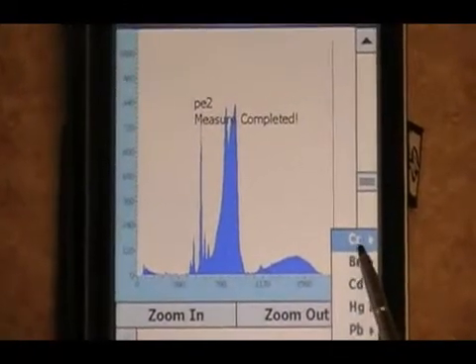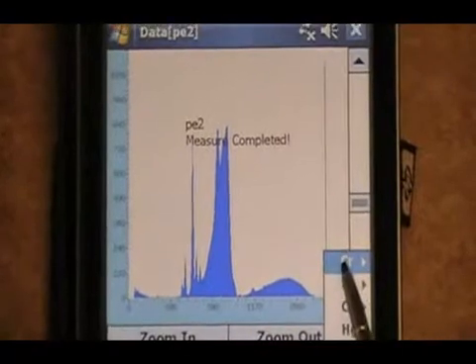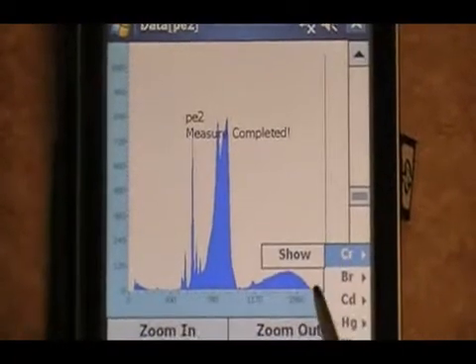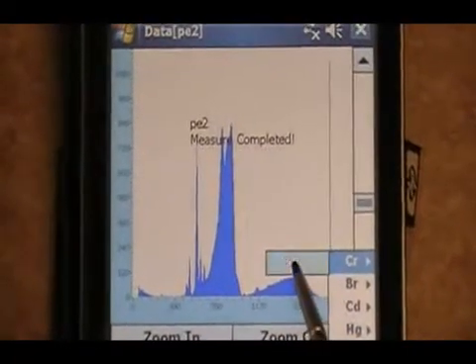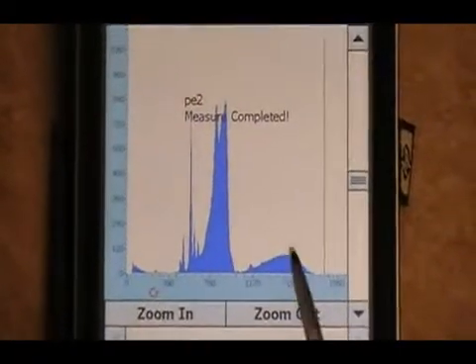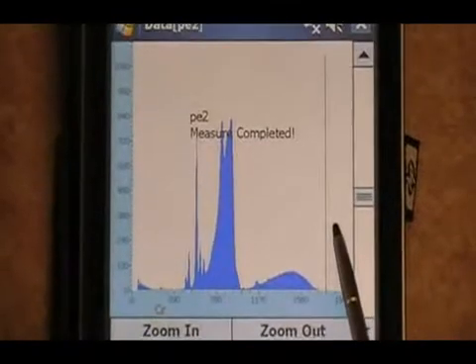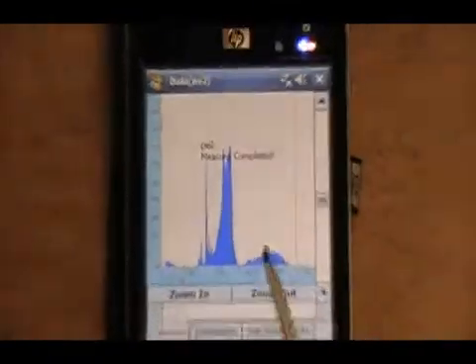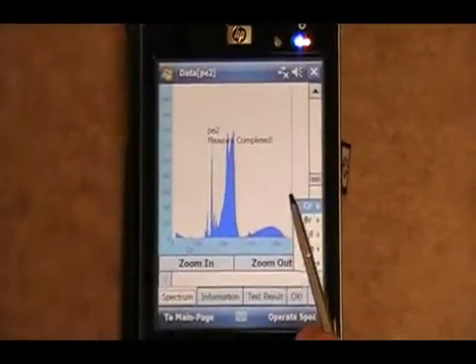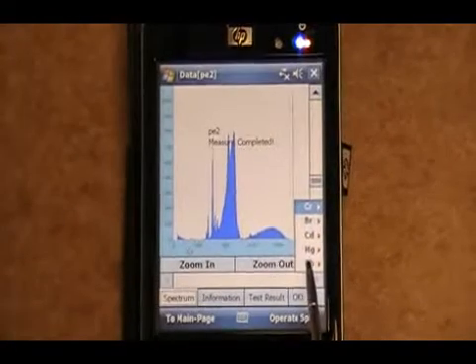For this specific measurement mode, we can then click on chrome and show each peak. There's the chrome. Press and hold again. And just for demonstration, I'll show the lead.